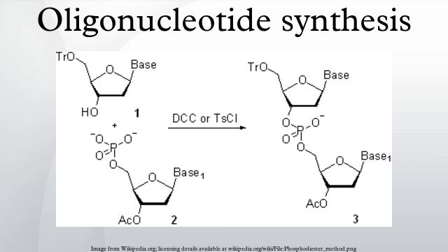Oligonucleotides remain permanently attached to the solid phase, which requires the use of linkers that are stable under the conditions of the final deprotection procedure. The absence of physical dividers between the sites occupied by individual oligonucleotides, a very limited space on the surface of the microarray and the requirement of high fidelity of oligonucleotide synthesis dictate the use of site-selective 5'-deprotection techniques.